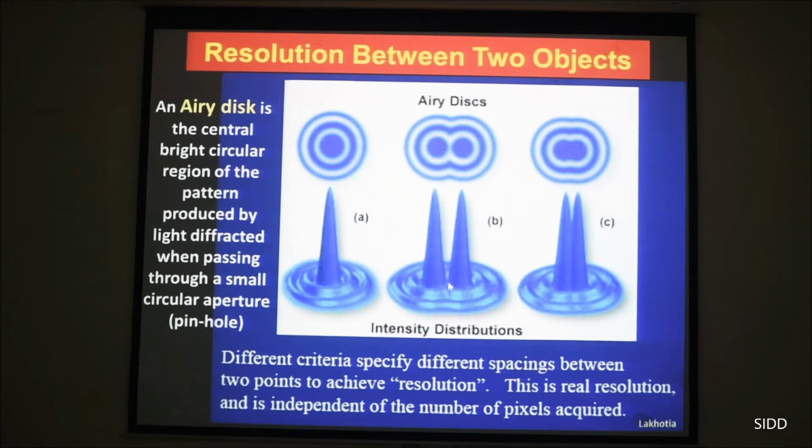Now, what happens is, let's say you have two pinholes very close by from which light comes in. If the pinhole points are spatially separated, you see them as two points. But if they are overlapping, your eyes will tell you only one object. You can't resolve them. And this is the most important principle that determines microscopy, and which we must understand.